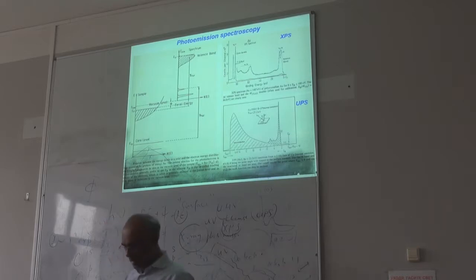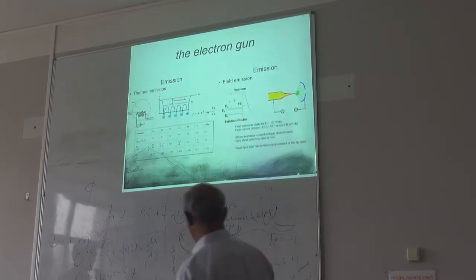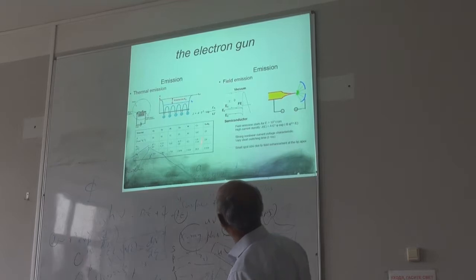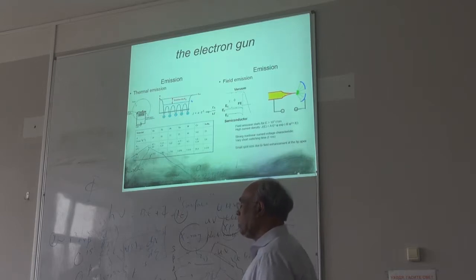I have that somewhere here. But you use only one of these methods. This is the thermionic current, like T squared times the exponential, and this is what you call the work function. So you have to measure this thermal current for different temperatures, then you can calculate your work function. The third one is something called the Kelvin probe.